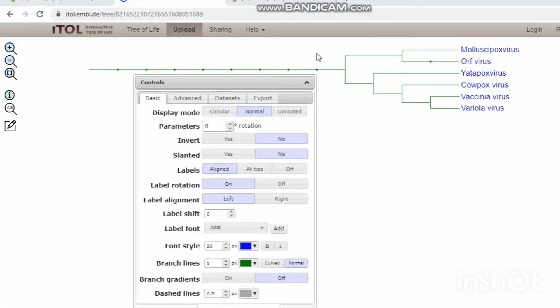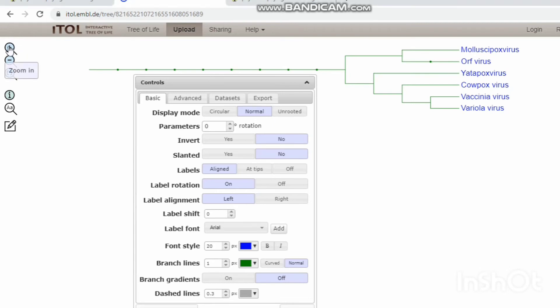The phylogenetic tree is now created, and this is the control panel of the tree. I want to change the font color and the branch length color. Zoom in and zoom out options are also available.